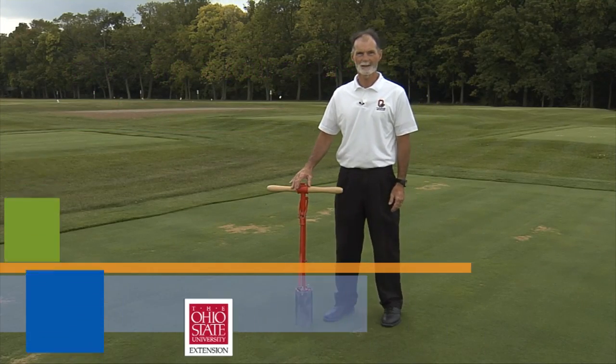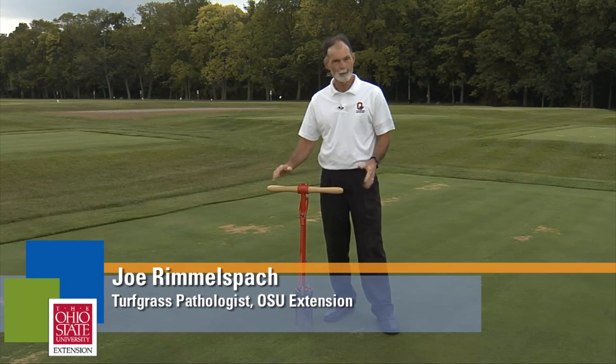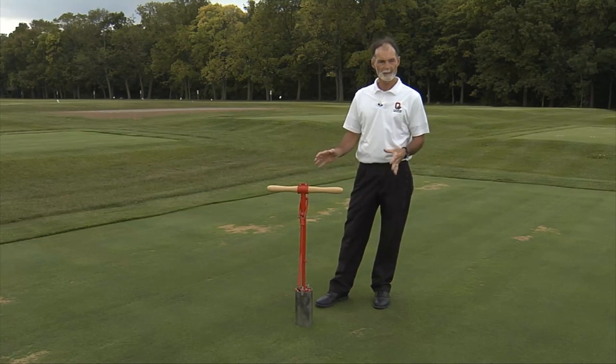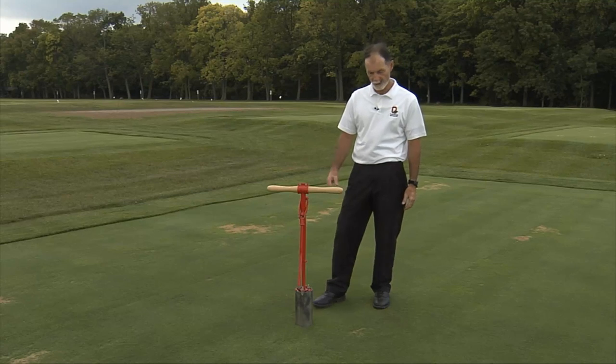Hello, I'm Joe Rimmelspach, turfgrass pathologist at Ohio State University, and in this video clip we're going to talk about how to collect, package, and send a golf course sample for diagnostic work. The first step is to collect a sample that's representative of the area or the problem in question.